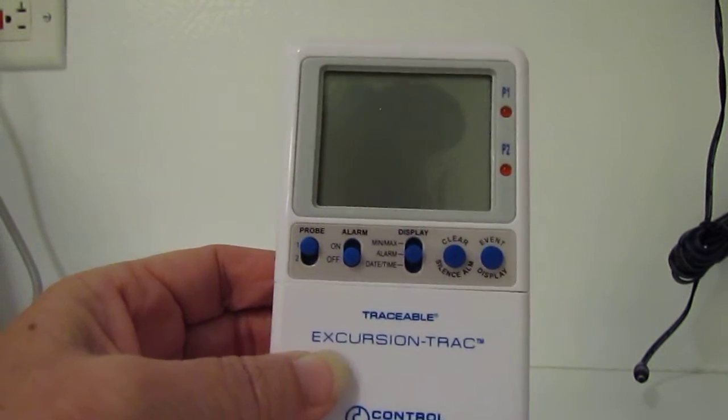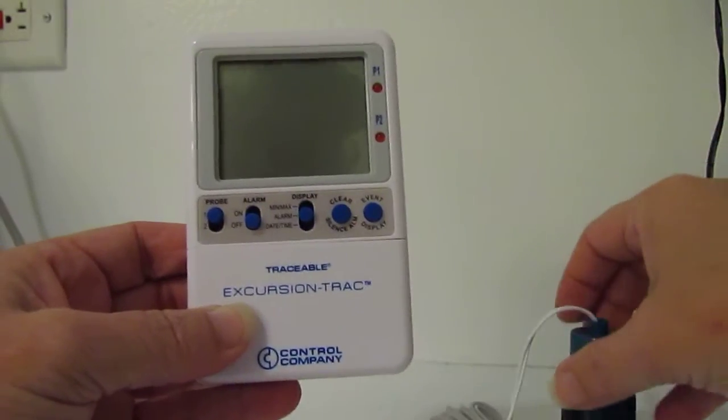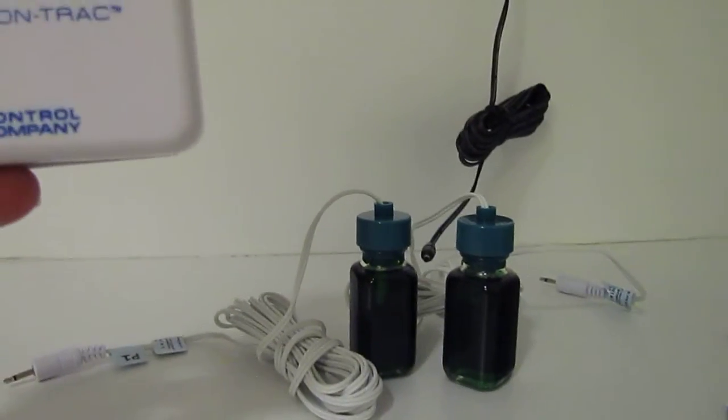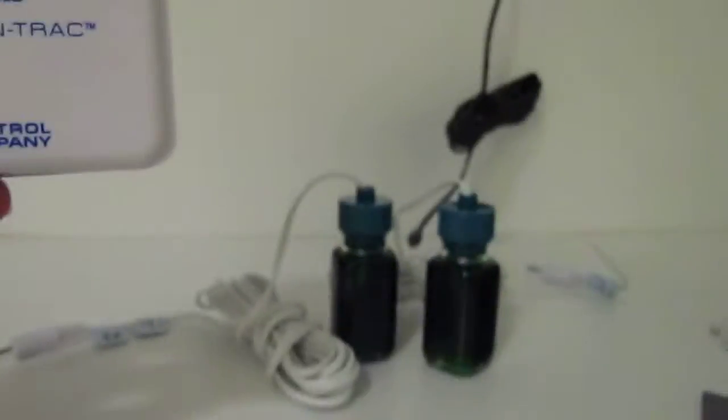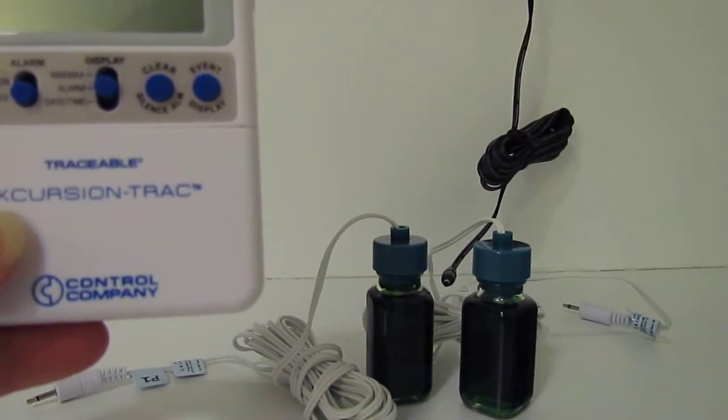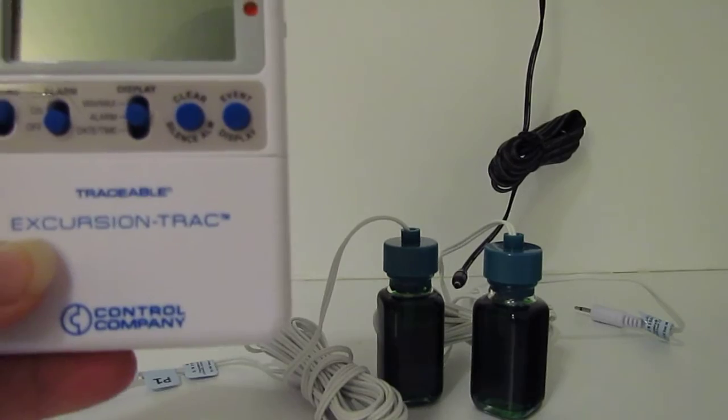When you first get the package, you need to make sure you have the correct thermometer, which has two bottles and two probes. If you don't have two, that is not the refrigerator thermometer. If it just has one probe, it is for your outreach cooler.